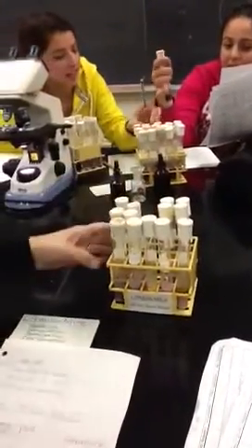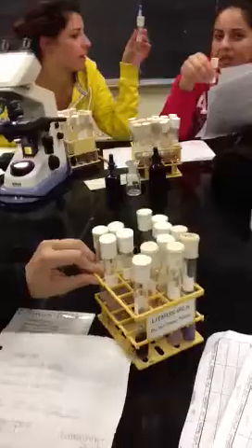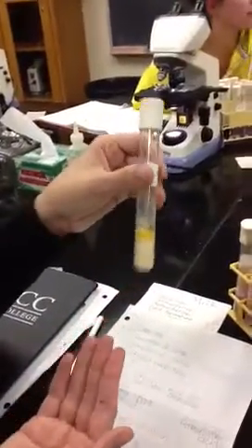Going further, I'm looking for the one that's creamy. This one's going to be considered creamy. And a creamy appearance is going to be reduction of litmus as well, and we can have the curds there that are up on the side.